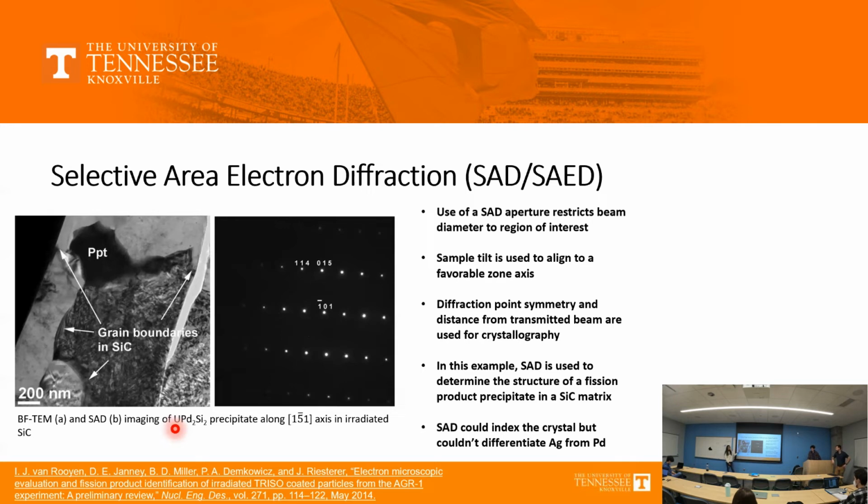It's literally a kind of a hole here. In the parallel illumination, your entire sample is getting illuminated. In convergent beam, I'm literally targeting my convergent beam at a spot.